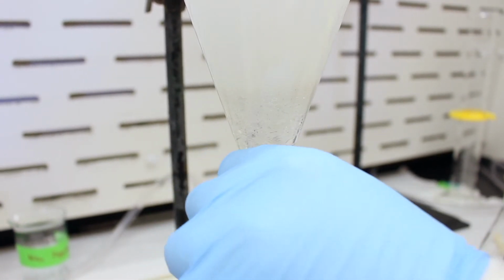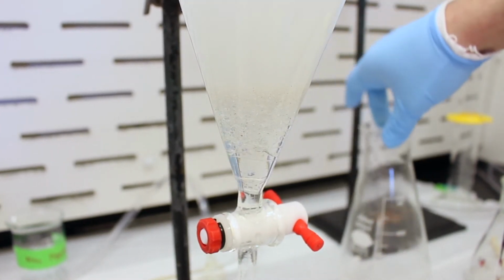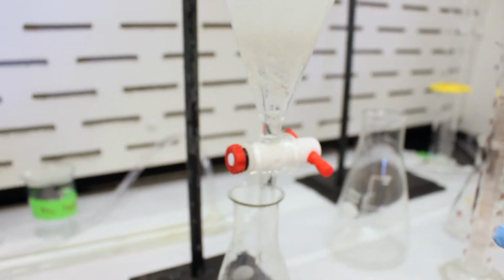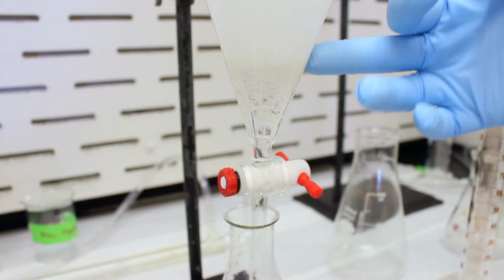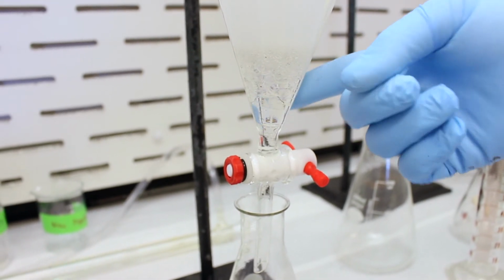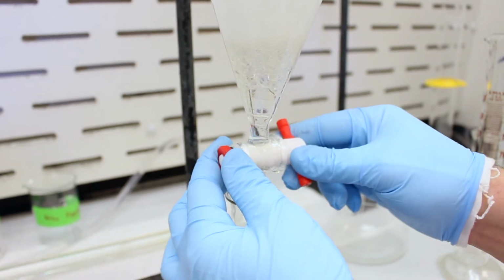Well, I think it helped a little bit, but it's still kind of bubbly there. Another thing you can do is try to drain it away, and sometimes it resolves itself. So let's just try draining it away. Now, we've performed our first extraction. Most of the eugenol now, 90%, should be in this DCM layer. So the eugenol has moved from the water layer into the DCM layer, and we want the DCM layer because it contains the eugenol. So let's try to remove some here.